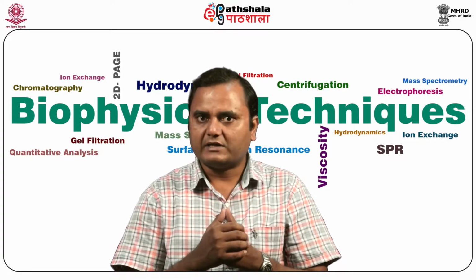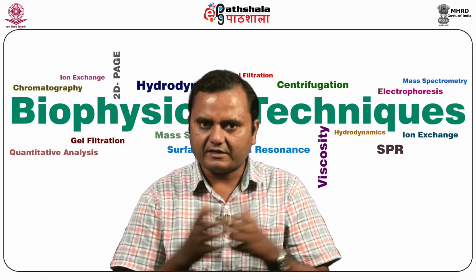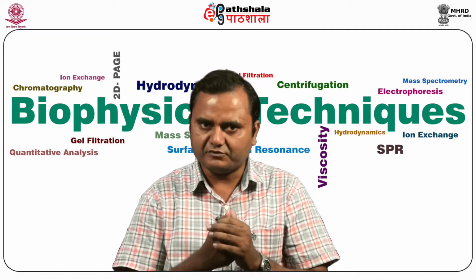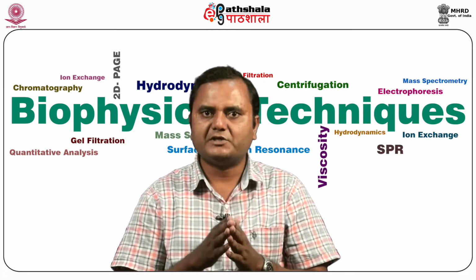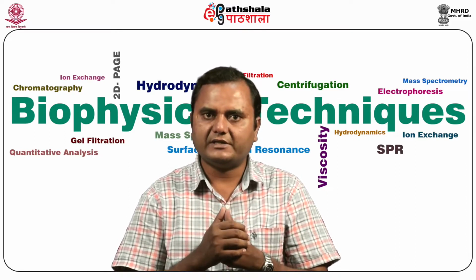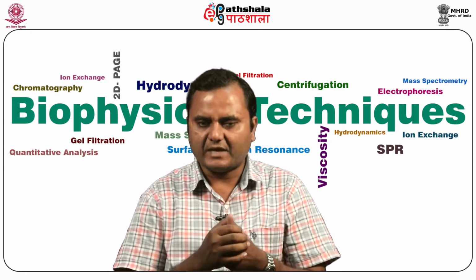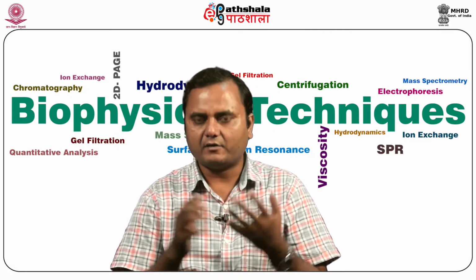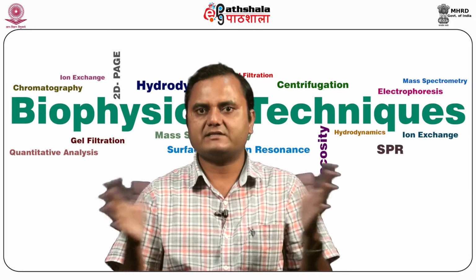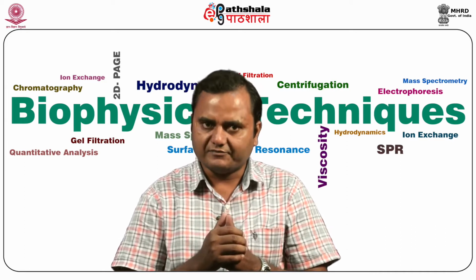Now we discuss the application of ultracentrifugation. As we already discussed the method and the principle, now we discuss the application of the ultracentrifuge. It is used for the examination of sample purity, that is, the quantitation of the size distribution in a polydispersed sample. For example, if you have any biological component like a protein, carbohydrate, or any cellular organelle, you want to see whether it is pure or there is some contamination. That can be performed by using ultracentrifugation.